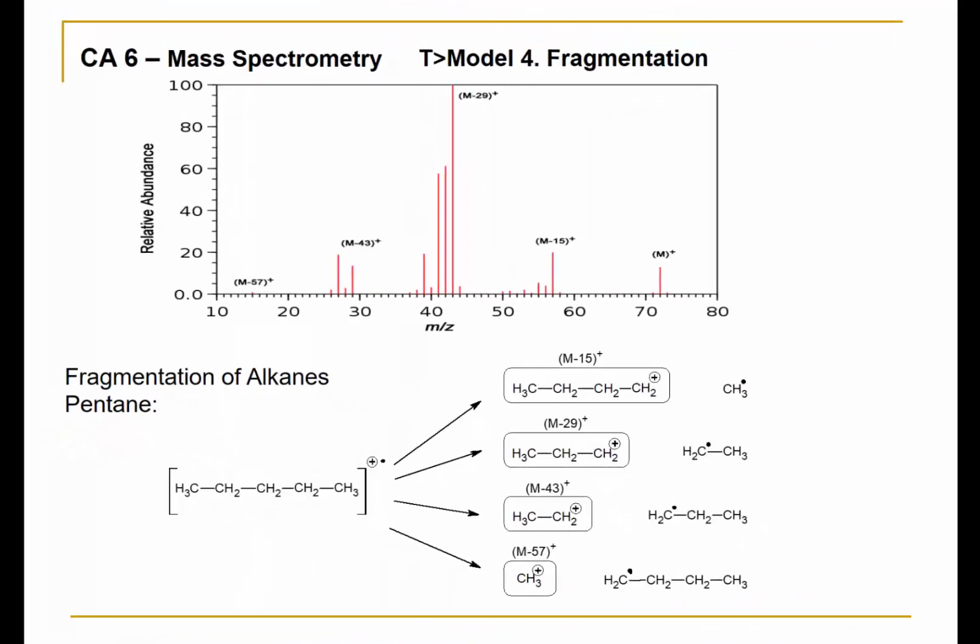In teaching module number 4, we will explore the representation and the interpretation of fragmentation patterns for alkanes and a few other functional groups. I want to highlight again that our intention is not to interpret every particular peak in a mass spectrum, but there will be certain patterns that will be helpful in actually distinguishing one molecule from another.